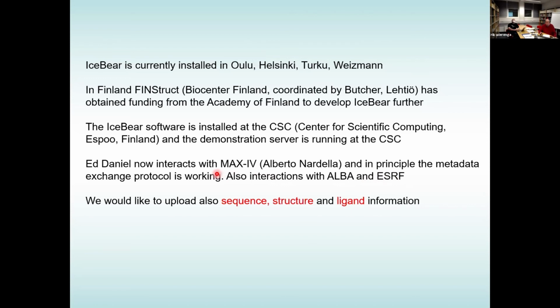There are all the time interactions with the ISPyB developers. It's a nice community, and we interact with them trying to get harmonized access to the synchrotrons, and also hopefully in future to be able to upload sequence, structure, and ligand information.